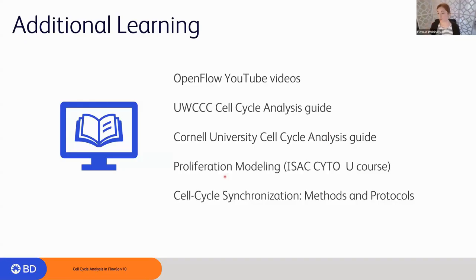If you're looking for more standardized formal learning, ISAC through Cyto University actually has a course that you can pay to take, or I believe it's free if you have a certain membership level, but has various modules, and you can actually earn CMLE credit if you are looking towards getting a cytometrist certification. And Methods and Protocols, very world famous textbooks for publishing standardized approaches from world experts, do actually have one on cell cycle. So if you're more of a textbook or ebook person, that would be a very comprehensive one, and I think it even establishes protocols for different model species and organisms.